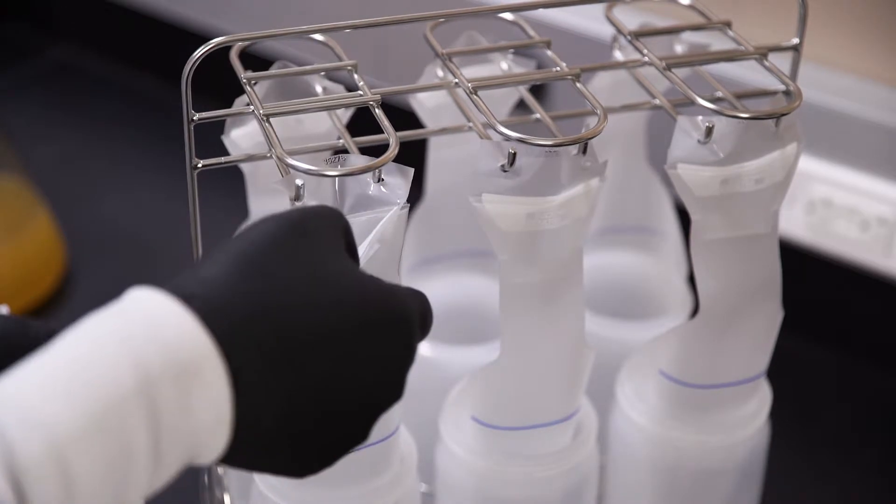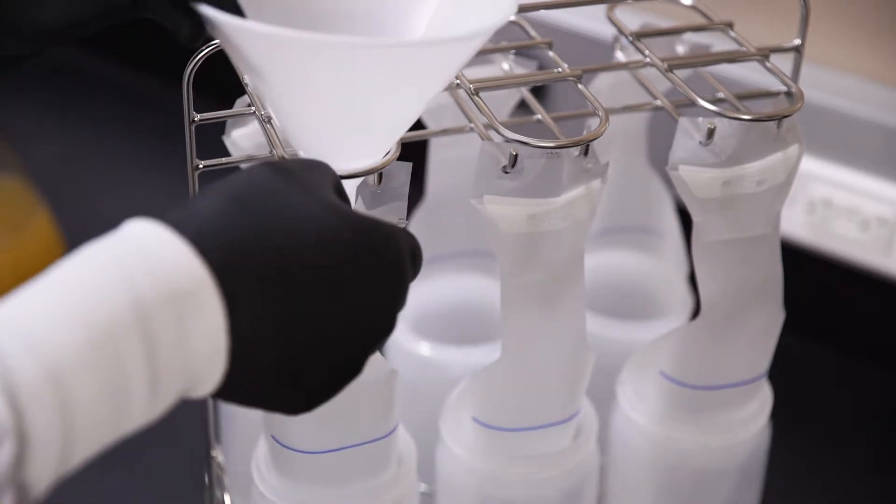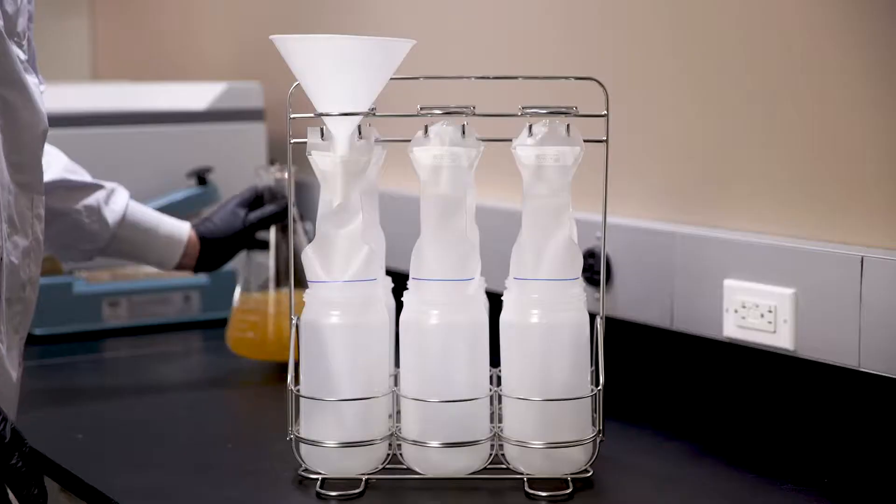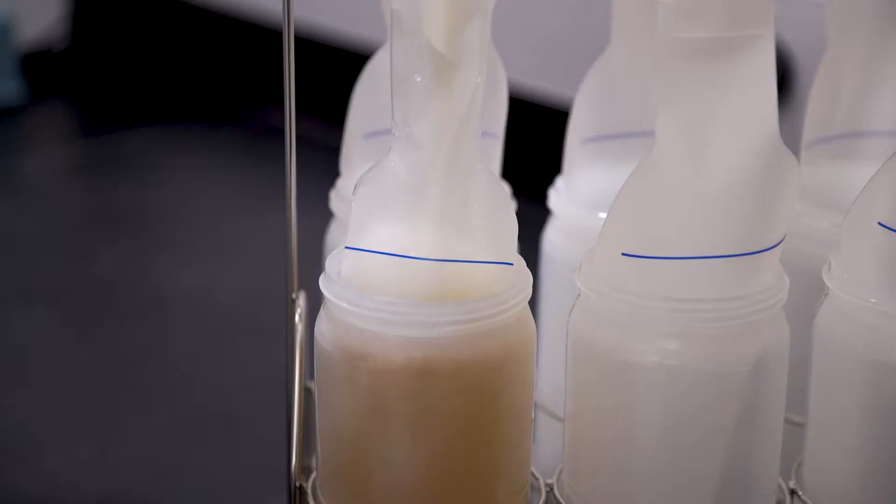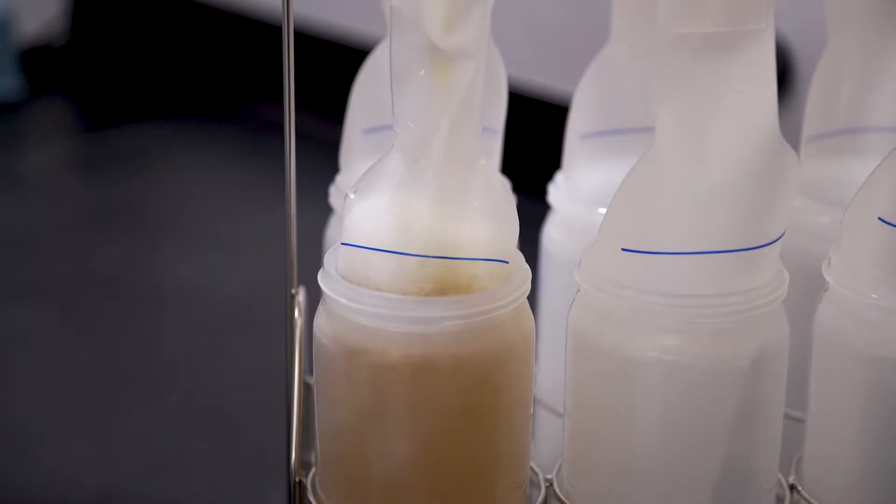Open the valve by pulling on the liner tab and insert the funnel until it rests on the rack. With the end of the funnel past the valve, pour your sample into the funnel until the liquid reaches the blue maximum fill line on the liner.